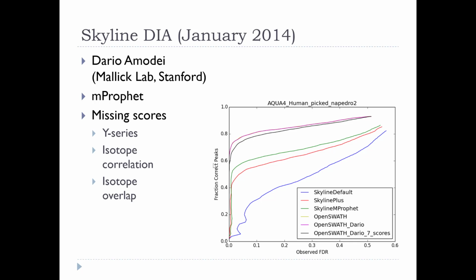So who can come up with an explanation for that? What do you think? Were we done? Did we need to keep working? Obviously, we need to keep working, but here's another piece of information.